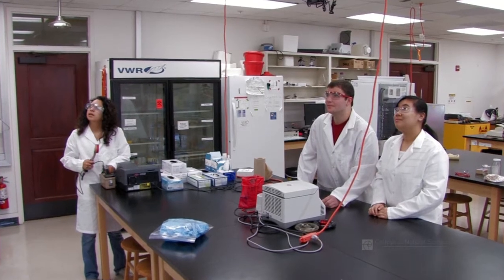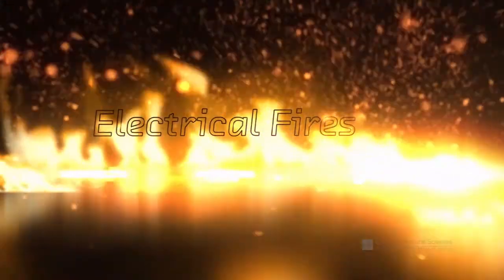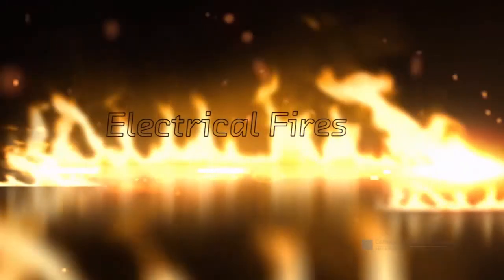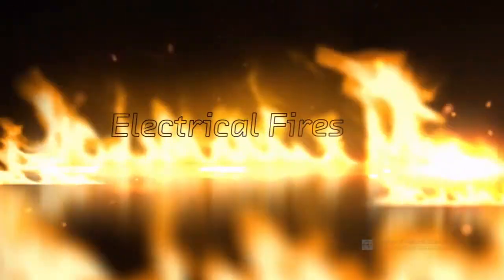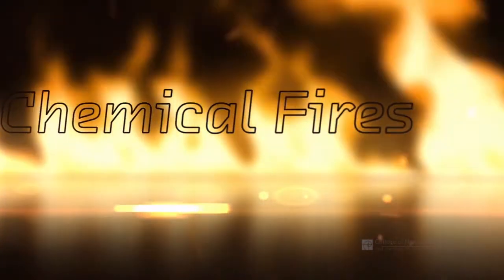Remain calm. Remaining calm will allow you to make rational decisions and remember your training. Assess the situation. Fires come in a wide variety, from small to large in size, electrical or chemical, and there are special considerations for each type. Determine if the fire is in your control and if you will need to evacuate. Remember that small fires can spread quickly.